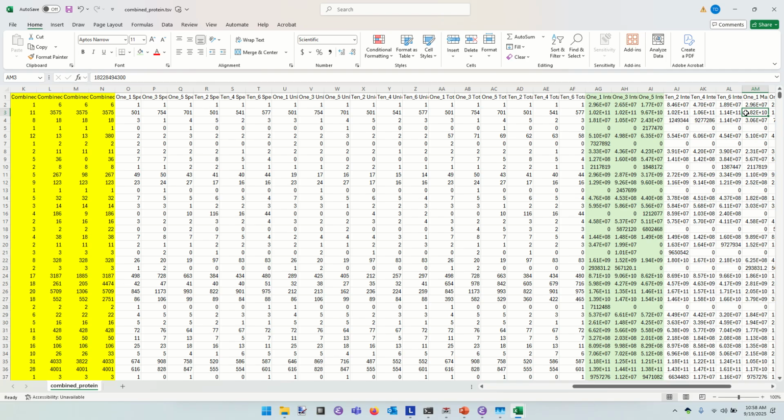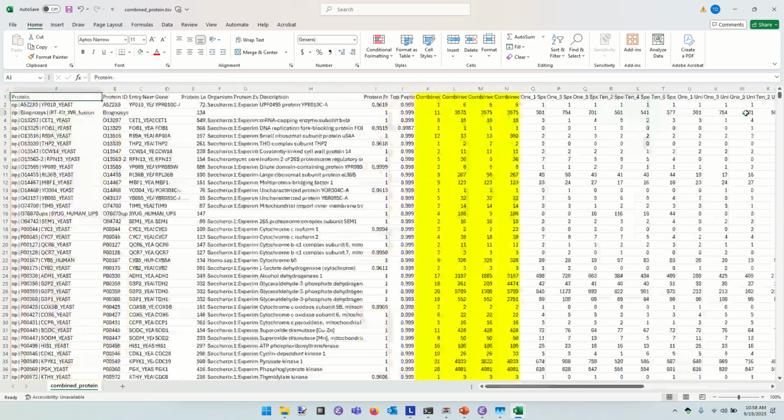So very different random seeds could lead to a change in that. Yeah, if mine says there's a 94% probability and yours says there's a 96, that's well within reason. Well, it's more about how you didn't change the order of the proteins, right? You just opened it easily. So I assume we have the same order.